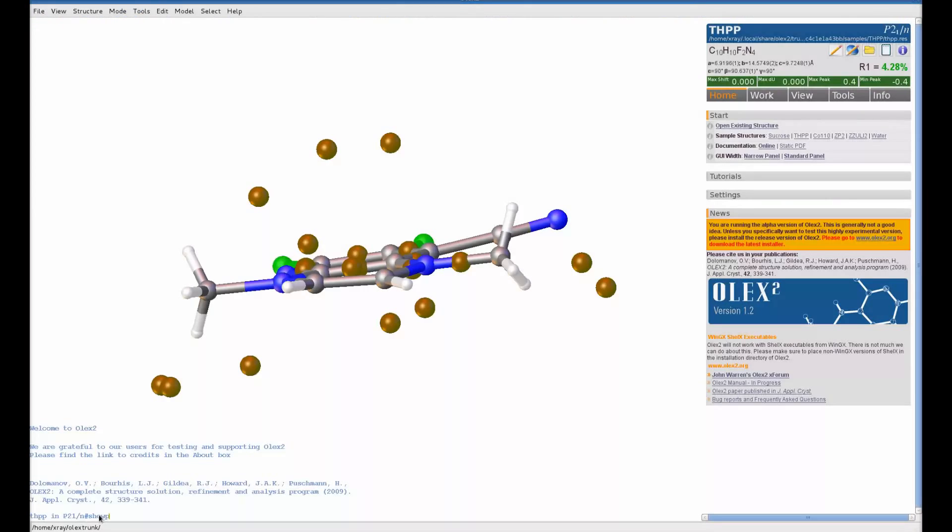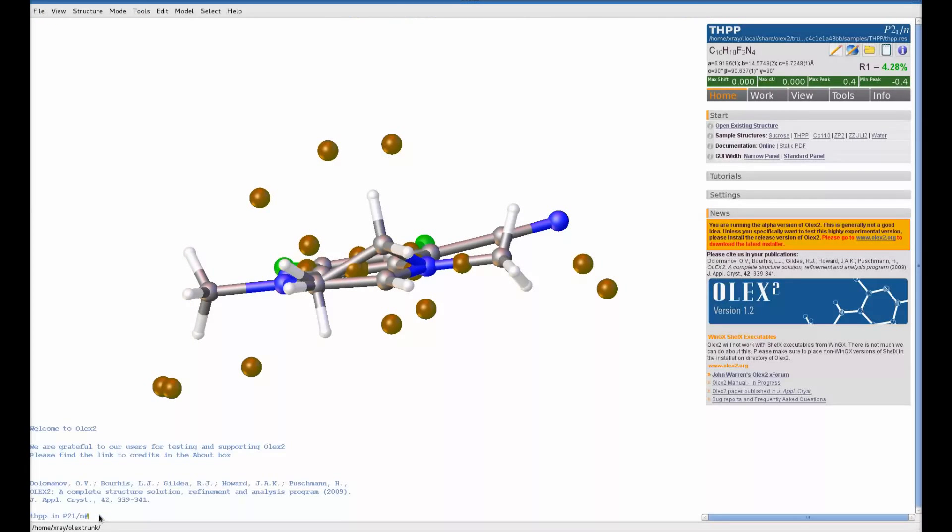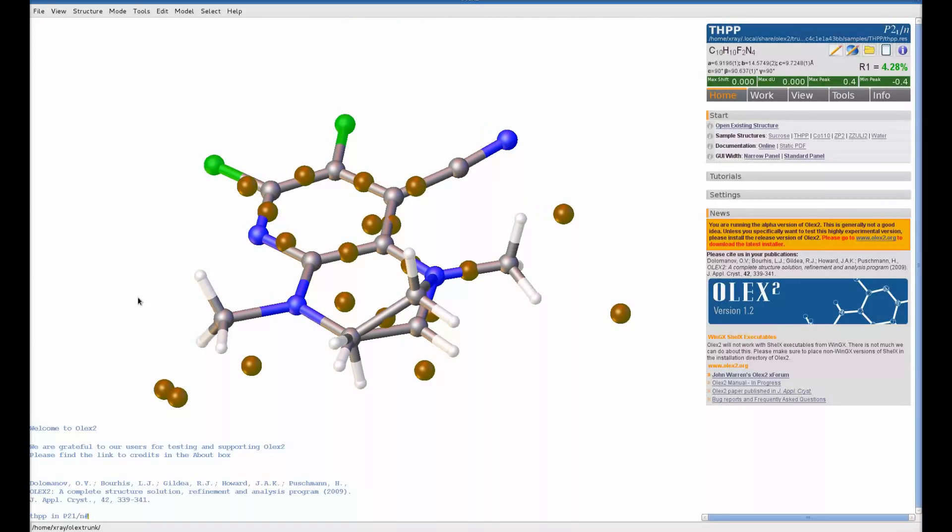If we want to go back to showing the whole model, we can type SHOWP. OLIX2 will retain that SHOWP level across multiple refinements, which makes it really useful for refining disorder. And that's it, that's SHOWP.